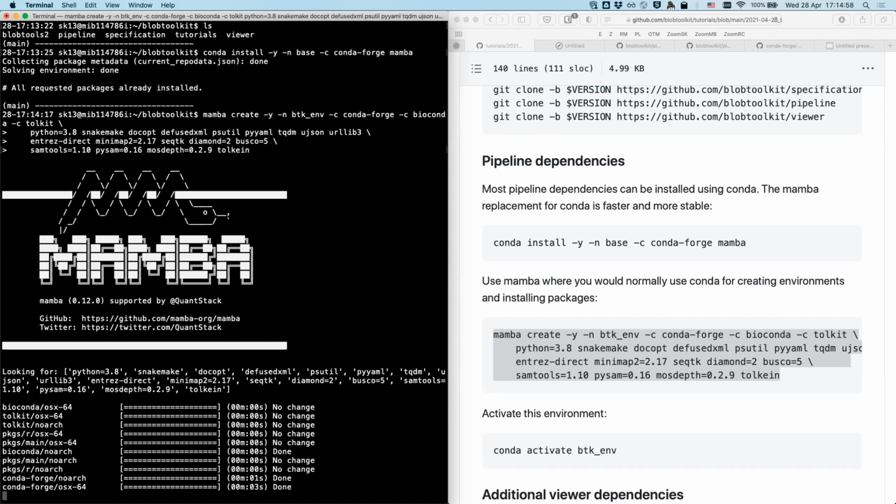So has everybody pressed enter? Because this will take a while, so I can chat with you at that time. Yep, cool, Sam. Anybody else having trouble getting past to this step? We have time. We can wait for a bit.